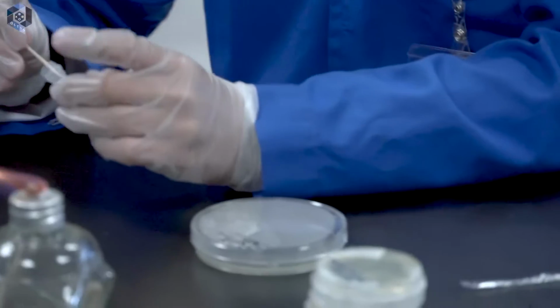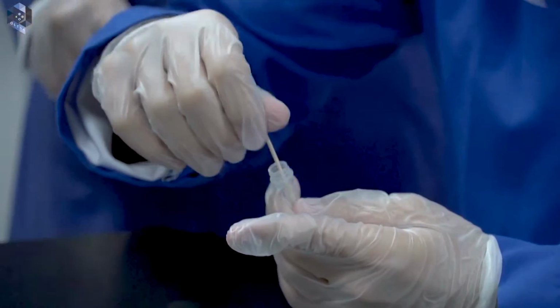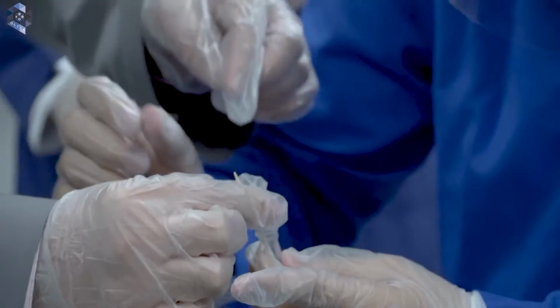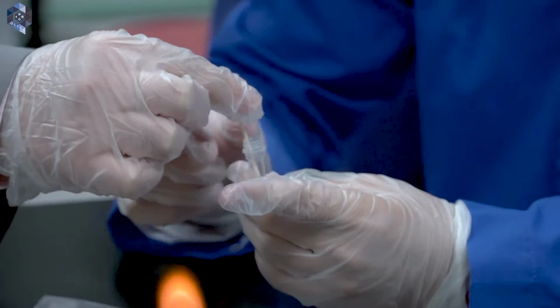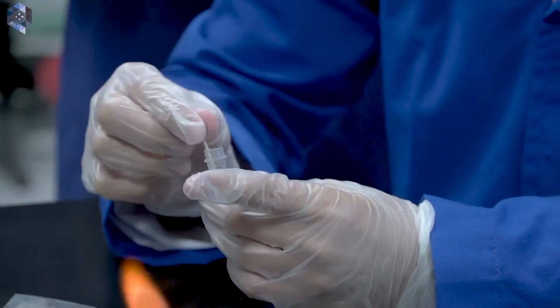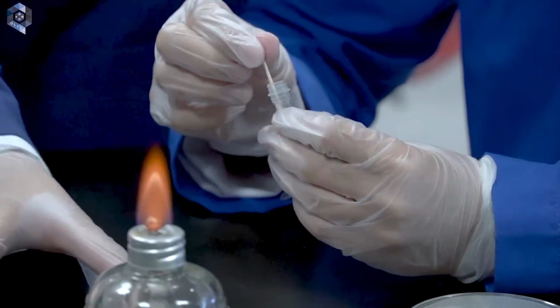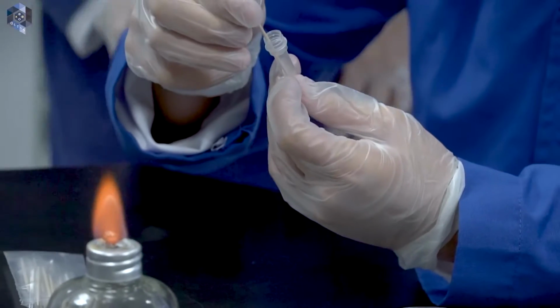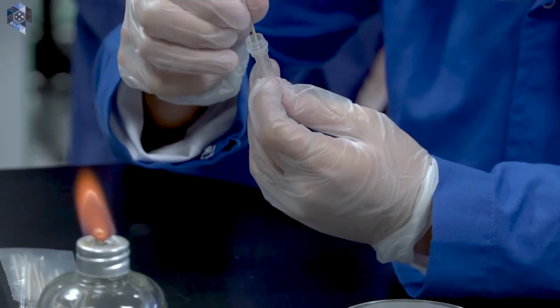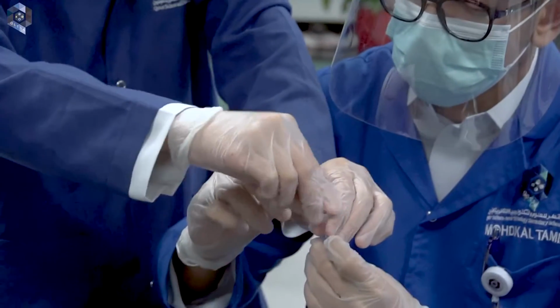Spiral, like that. This is how to do the spiral. Okay, continue doing that. Did the color change in the centrifuge tube? Check it. Did it become a little bit cloudy, turbid? Okay, close it then. Good.